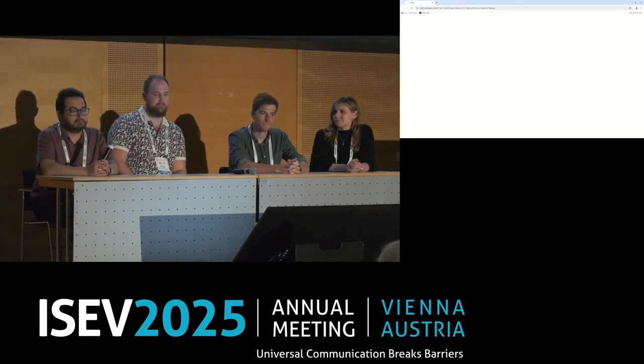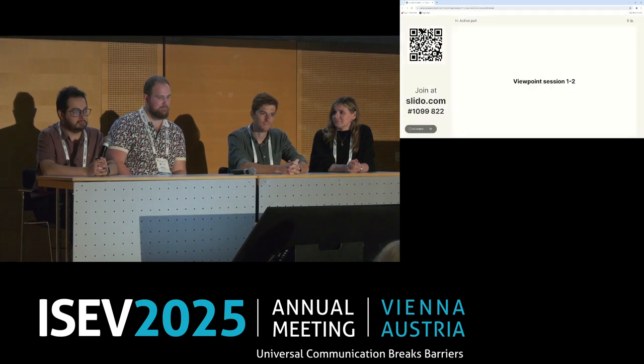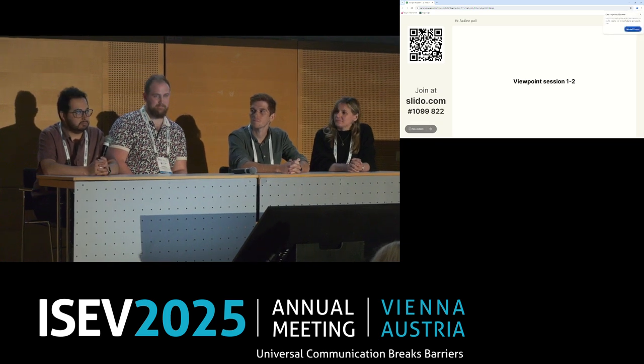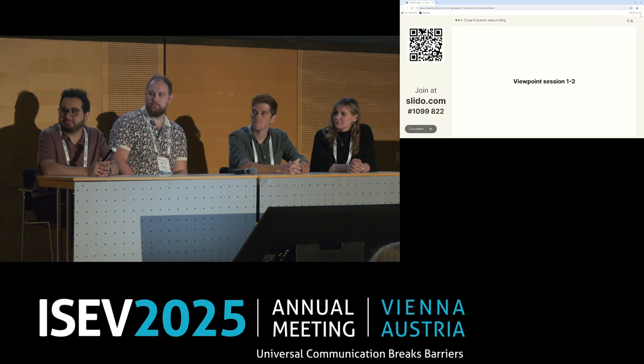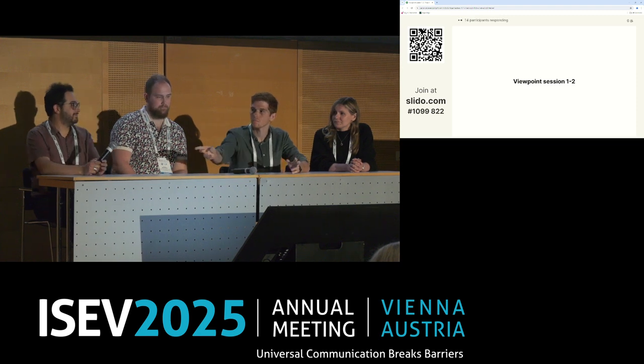So first of all, we learned a lot, starting from a source that you have to prepare extracellular vesicles for particular downstream applications. So there are multiple methods you can select. Starting from your experience in the lab, what are the most important steps that you consider when you set up a protocol to prepare EVs from your biofluid of interest? Yeah, let's kick off with Claudio.